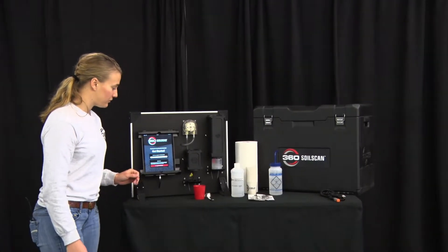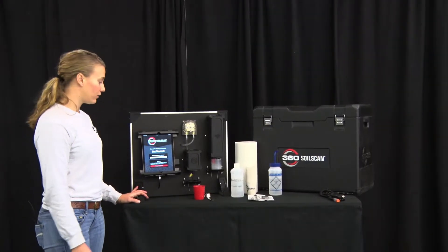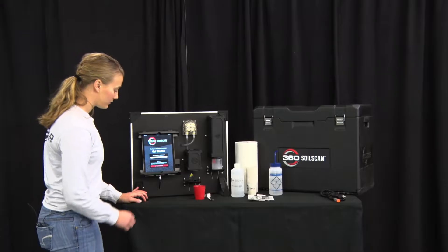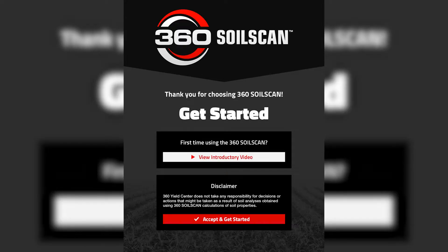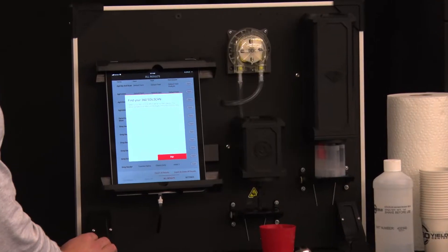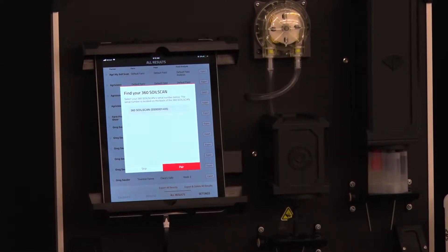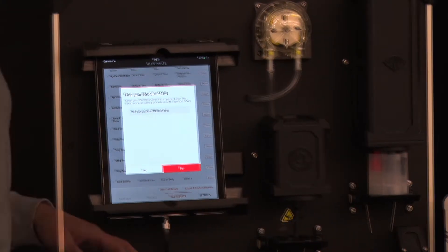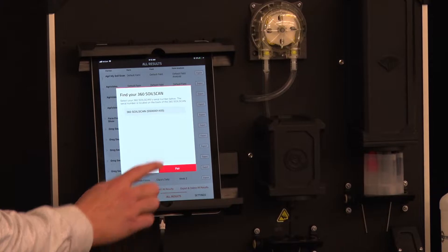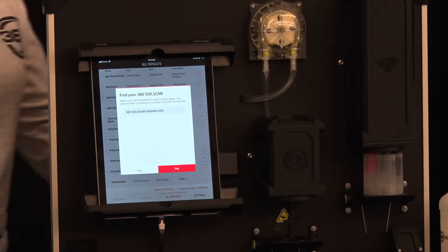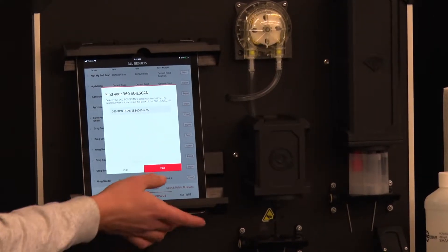While the sensors are soaking we're going to go ahead and pair our iPad with the SoilScan. So when you open the app this is the first page you'll see. Select accept and get started. And wait while your iPad finds the SoilScan. The serial number that you see on the app here is on the back of the SoilScan. Simply select pair.